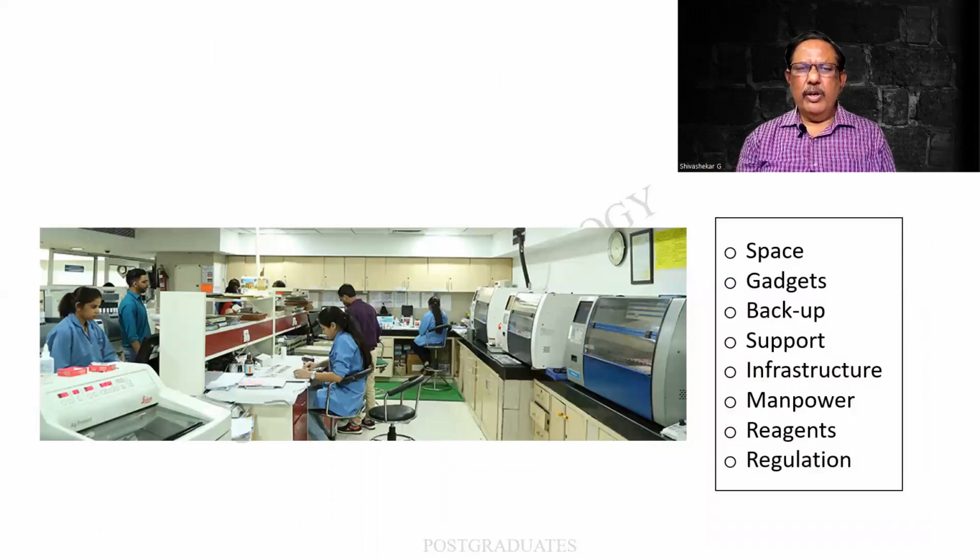And look at the modern lab. The concept of it basically, look at the space that is there. And always you find that there are no enclosures. This kind of design was appreciated by one of my professors, Dr. R.A.T.S, so that if you are in charge of the laboratory, you stand up in one place and you have a vision of the entire laboratory. That's a better word. So there is space. All the gadgets are along the wall. You will be able to move around. And the chairs and tables are all designed with leg spaces.